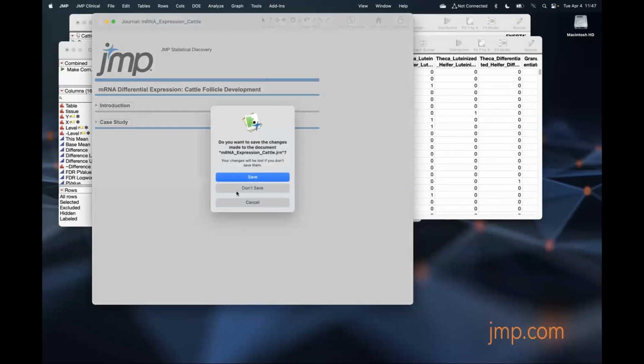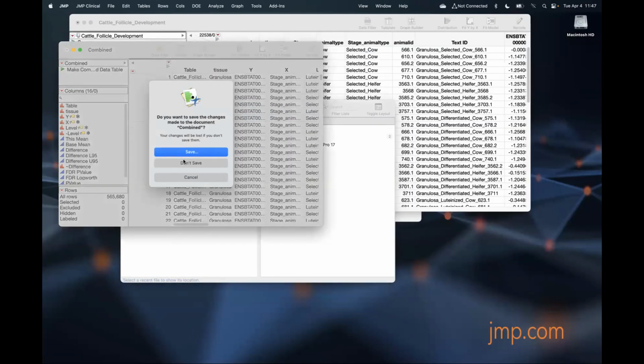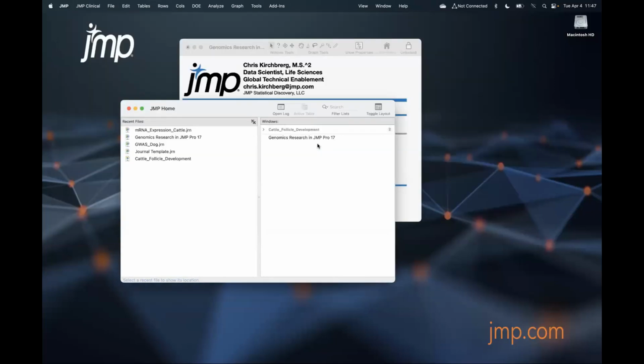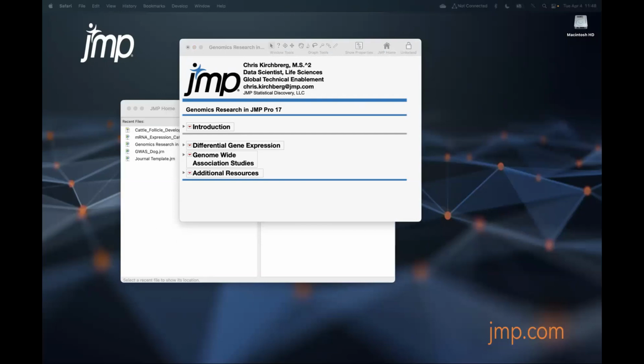And so that's differential expression. And let's close some of these things up. I think it's just about that. All right. Close all. There we go. So that's that one. I think there's a couple other questions we'll get to in just a second. So let's do genome-wide association tests. Oh, and here's a gene expression one I want to make sure I answer. So co-expression network analysis, we don't do co-expression network analysis yet. Again, you could do correlation between genes, but not from a network point of view.